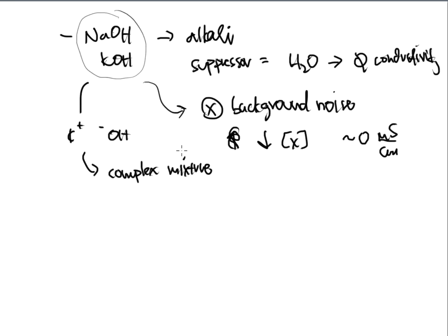In addition to this, you have to worry about sodium hydroxide and potassium hydroxide sometimes, because some of the columns, if you are not very careful, can be damaged by your sodium hydroxide and potassium hydroxide mobile phase. So you have to make sure that you pick out the proper column. That proper column has to be suitable for an alkali mobile phase. If not, then the stationary phase in that column can start to degrade and break apart, and that stationary phase is now ruined, and you will not get separation no matter what you do from that point until you replace the column with something more proper.